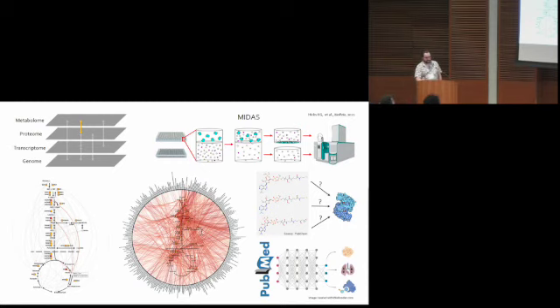But identifying these interactions in a high throughput manner has been very difficult. So something that's been developed in our lab is this MIDAS platform. Sorry, hopefully you can see what I'm pointing out with the laser, but this top right, where we have this plate where each well has a dialysis film. On one side, we start with isolated purified protein. The dialysis film pores are small enough that the protein can't exchange through the chambers. But on the other side, we have this metabolite pool with over 400 metabolites that are physiologically relevant.